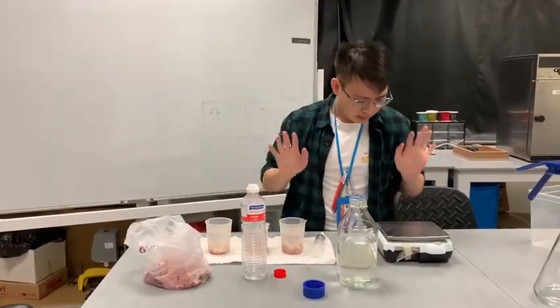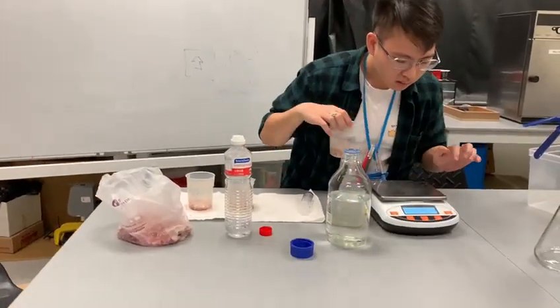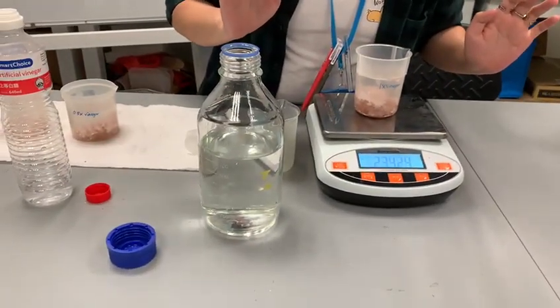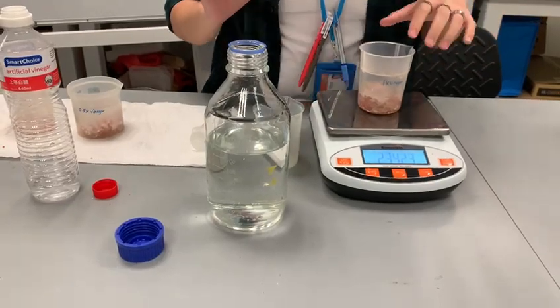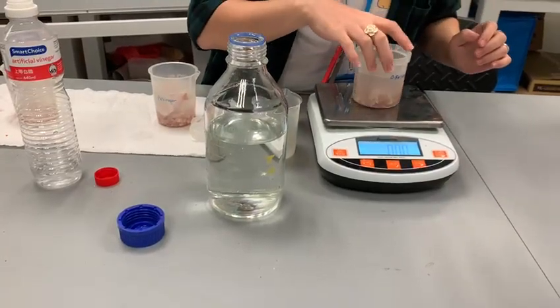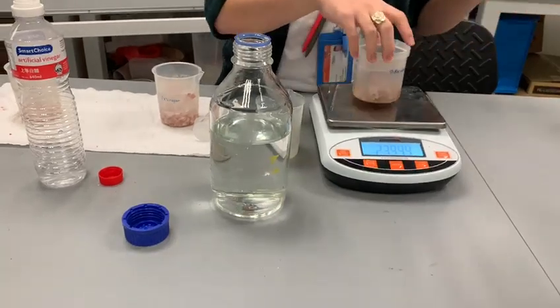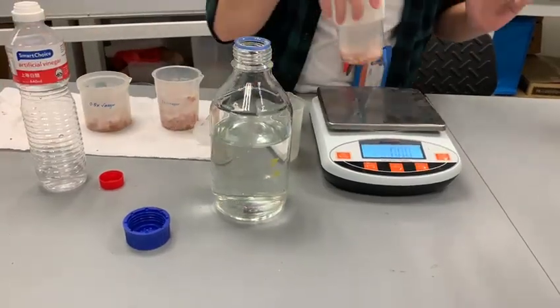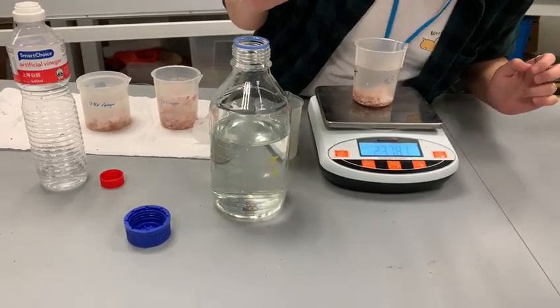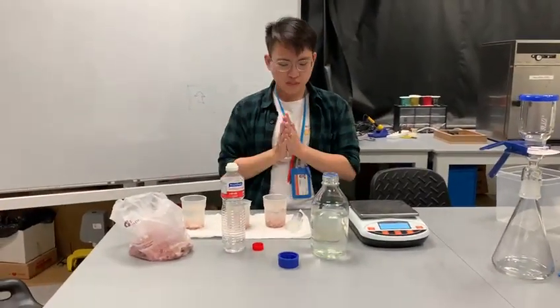So let's quickly measure the initial mass. This one is 234.23 grams, and then this one is 234.43 grams. Oh, I'm quite accurate actually. And this is 237.81 grams. So this is the initial mass of the setup.